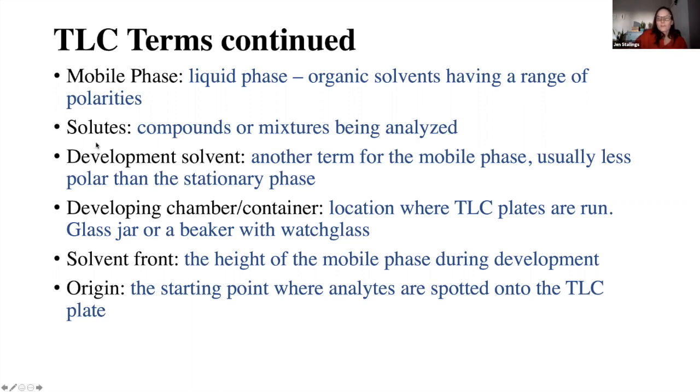Next is solutes. You're going to see in the video that that's what you're going to mix with some type of liquid, and you apply it to your TLC plate. You spot it onto your TLC plate.